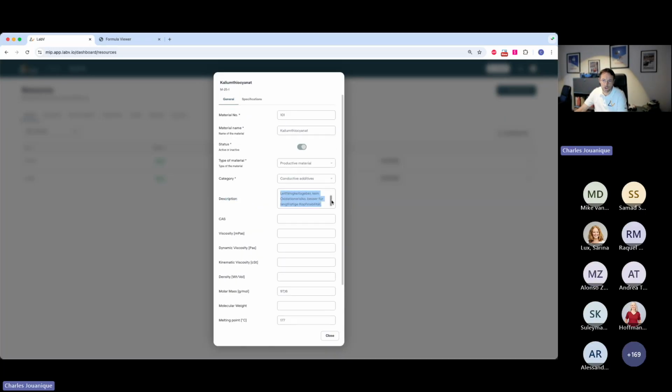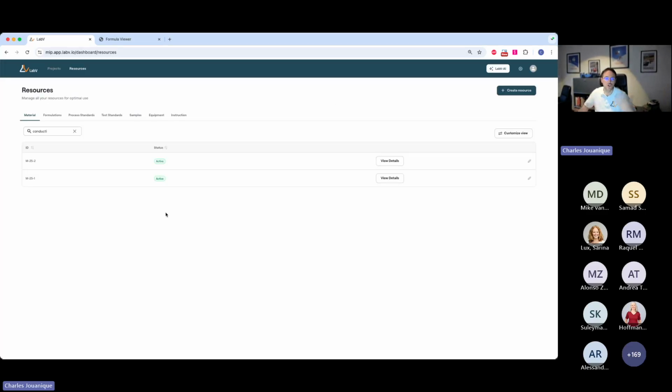It's obviously in German because we have a German lab in the background, but it's here that's the expertise from the people from my team. It's not something that is in a data sheet. That's nowhere. To say that it's milder and it's very helpful to have a more controlled conductivity and it doesn't oxidize, that's something you don't know on the specification. You have to have worked with the raw material to know it, right? So that's exactly how we can basically use every data we have in a very simple way.